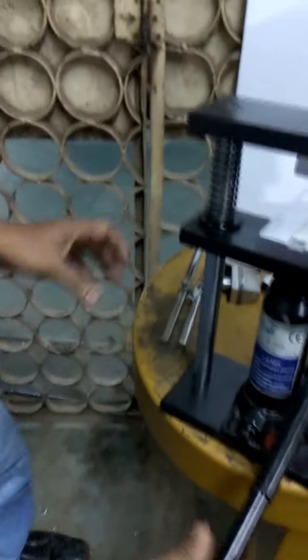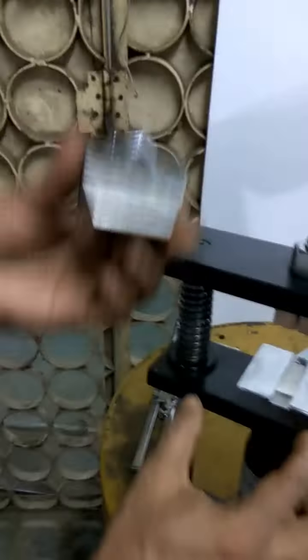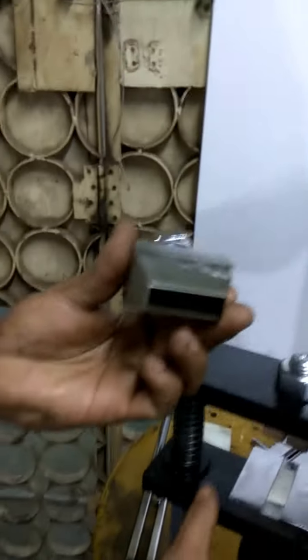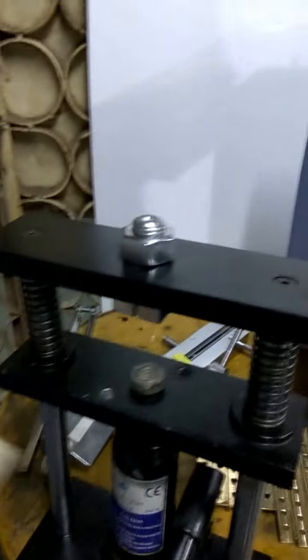There is a hydraulic jack base for preparing the sample. The sample can be cut with a dumbbell or a square cutter, along with an attachment. You just put it on the downside, place the cutter, and the sample can be prepared.